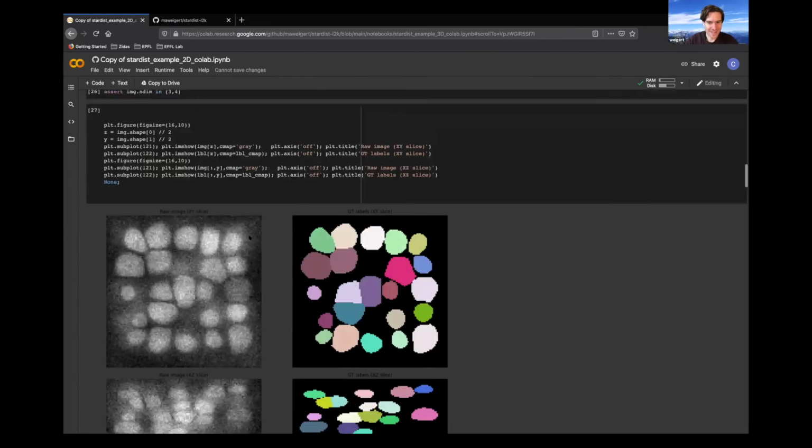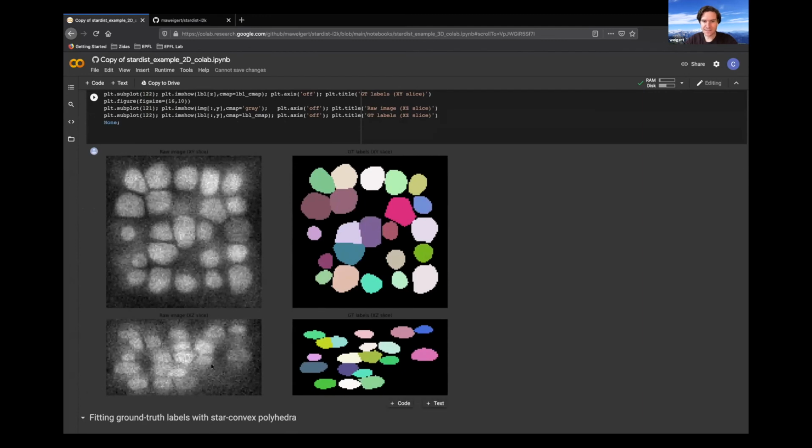So the anisotropy, if you look here at the XZ, at the axial slices of the input data, assume your input would be actually perfect spheres, and you see this image. What pixel size this corresponds to results in raw stacks that are looking like this, right? And here you would get this image, actually, if your pixel size in Z would be twice as large as in XY. They would look like this if you open them in Fiji, without rescaling. And that's just the anisotropy. The anisotropy just says how much more they are squeezed into each dimension with respect to a normal sphere. And in this case, they're squeezed twofold along this dimension. So the anisotropy factor along this dimension, which is the first dimension, is 2, and the others is 1, right?